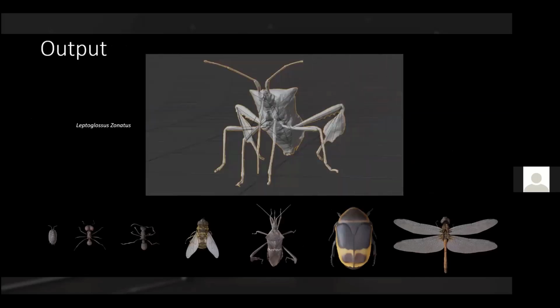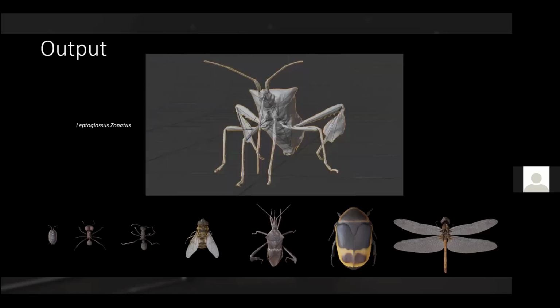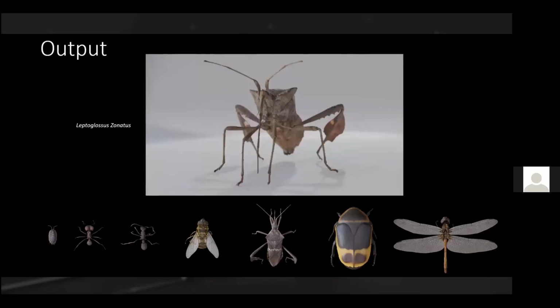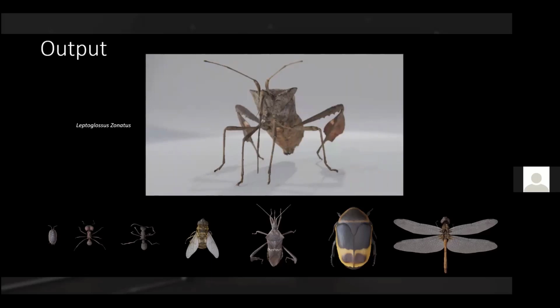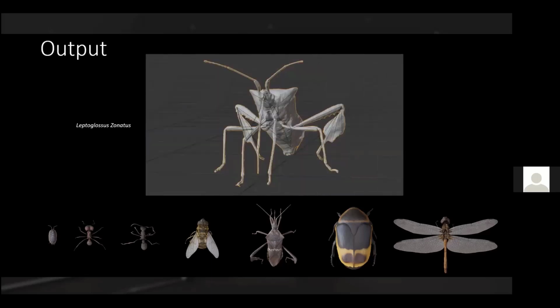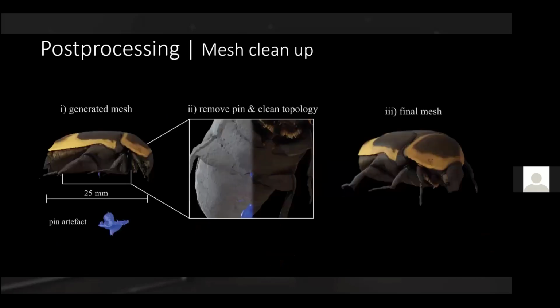In the bottom, you see a couple of examples. These are images of the 3D models, and in the top, you see a slider that goes between an actual fully rendered model, which then looks relatively nice because you can have realistic shade and lighting, etc., and the neat raw model, if you will, without texture and color information superimposed here of a bug that we work with. Okay, so you can make these models, and of course, what many people in this call will be interested in, or so I assume, is what quality these models actually have.